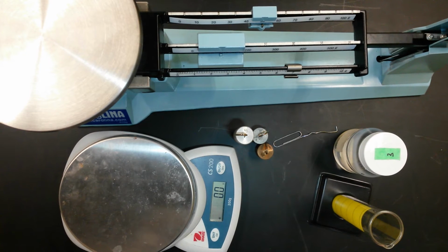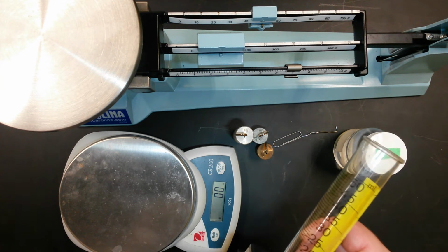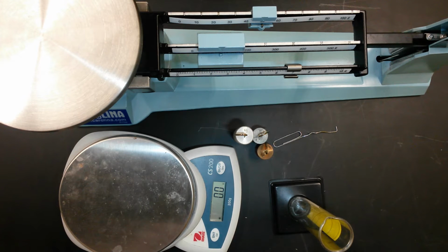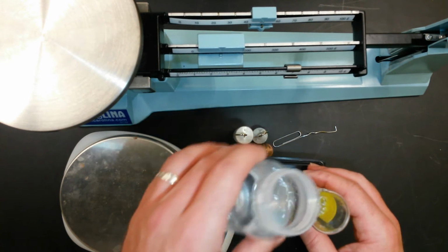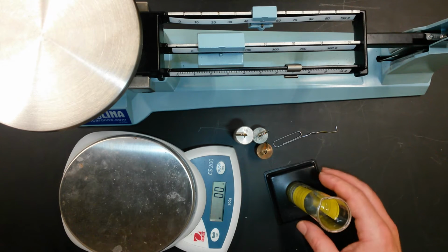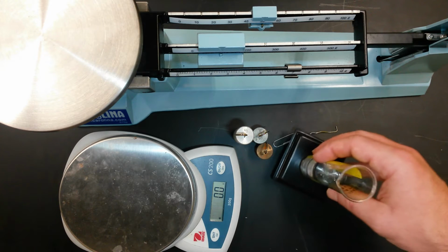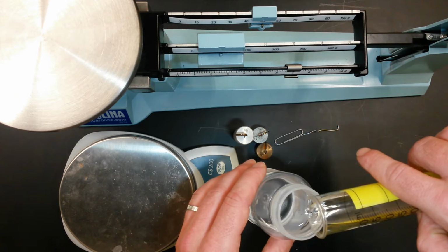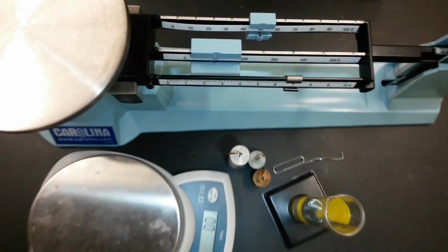Okay, and for each of those objects we're going to measure its volume as well as its mass. So let's start with volume. To measure volume you use a graduated cylinder, which you can see is marked in milliliters. And you're going to start out by filling it part way with water. I recommend filling it around 20 milliliters, although the exact number of milliliters is not important. But if you have it too full, it might overflow when you drop an object into it. And so I recommend around 20 or maybe 25 milliliters to have the best results.